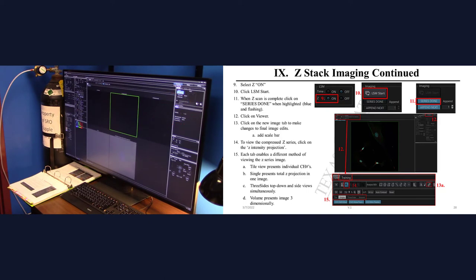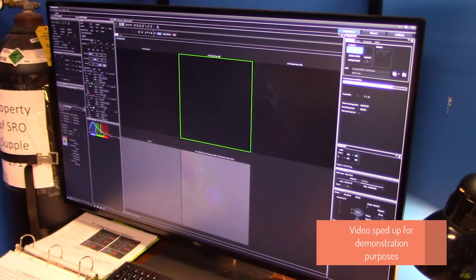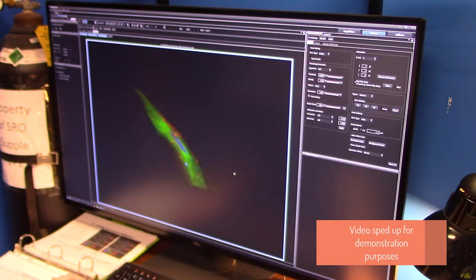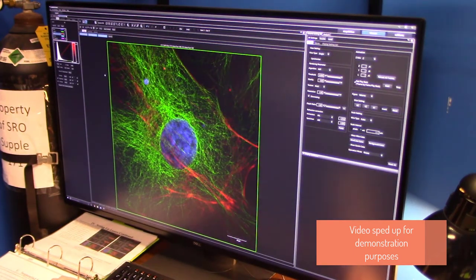Once a Z scan has completed, click on the Series Done button when highlighted. It will be blue and flashing. Next, click on the Viewer tab. Demonstrate how to scroll through the different slices in the micrograph, how to view the 3D image, and rotate. Add a scale bar to the image and update the LUT tool if desired.